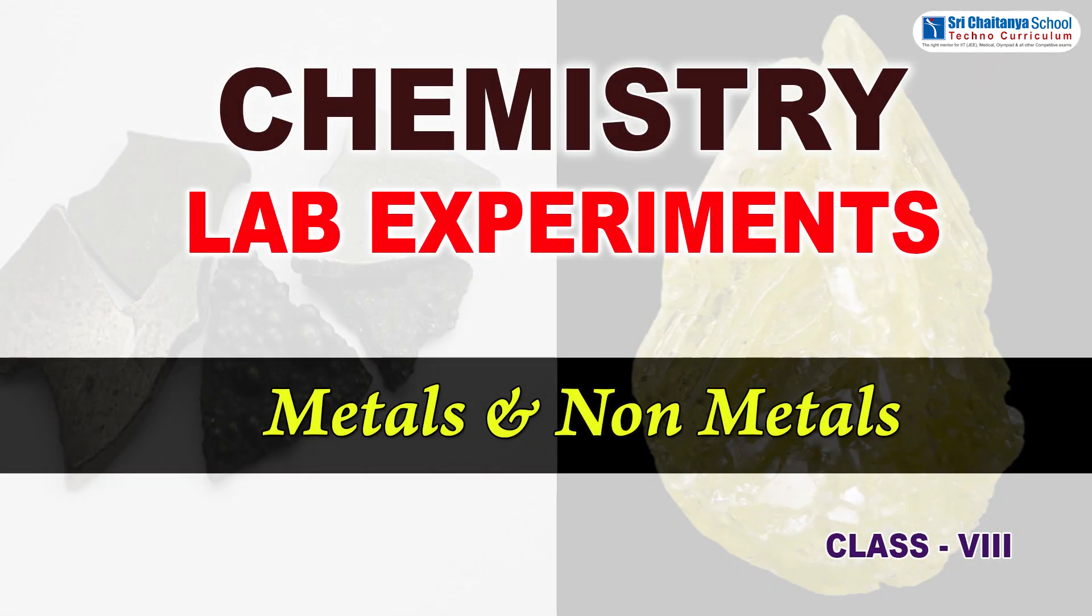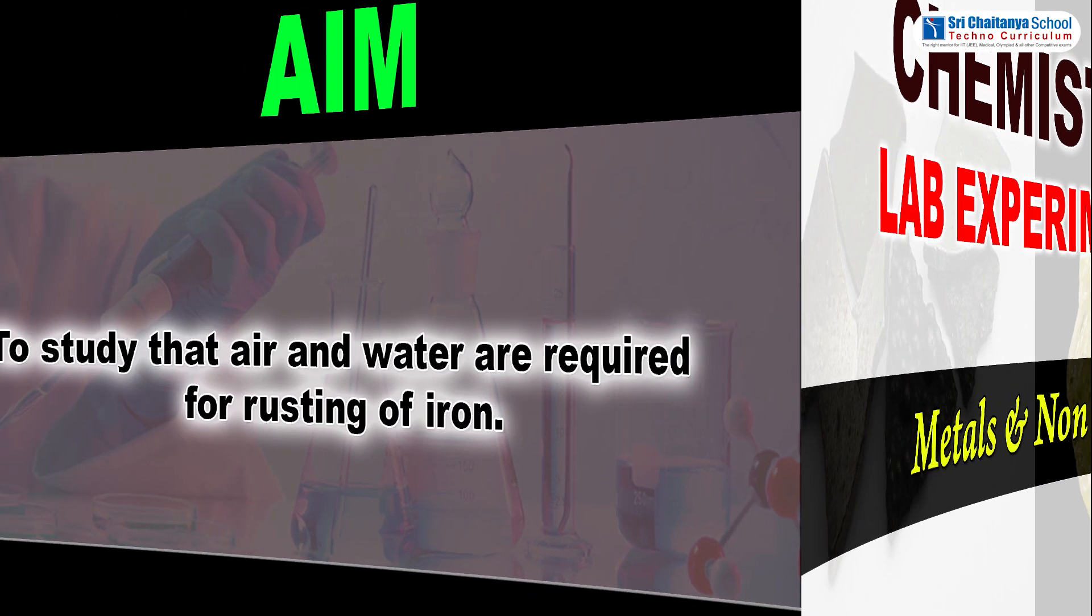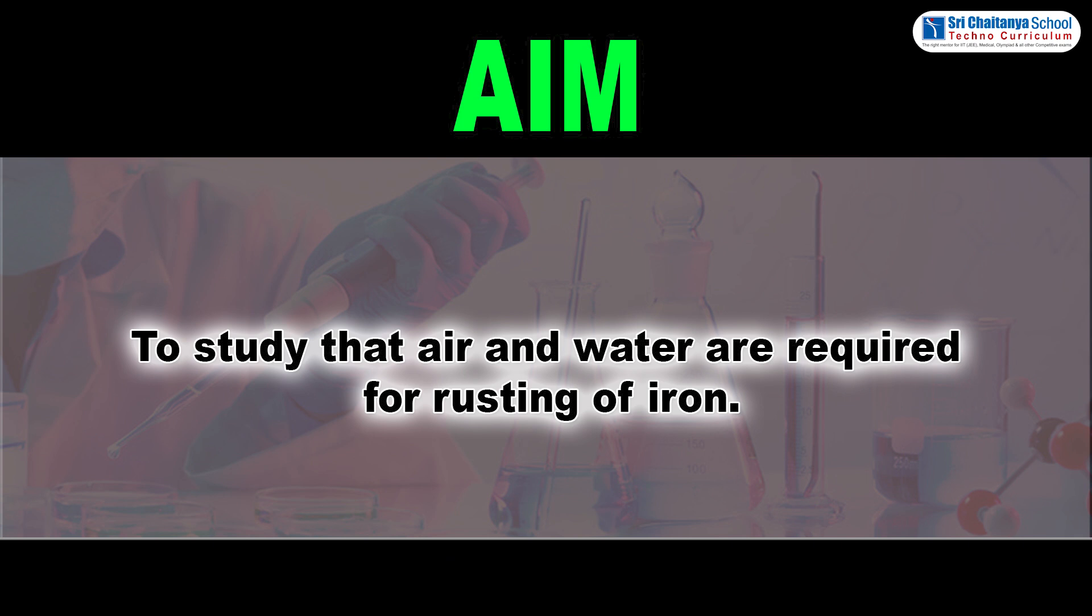Hi children! Now it is time to do chemistry lab experiment. The chapter name is metals and non-metals. This experiment belongs to 8th standard. The aim of this experiment is to study that air and water are required for rusting of iron.